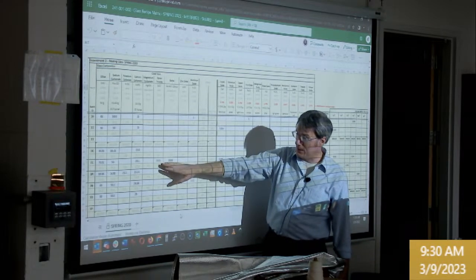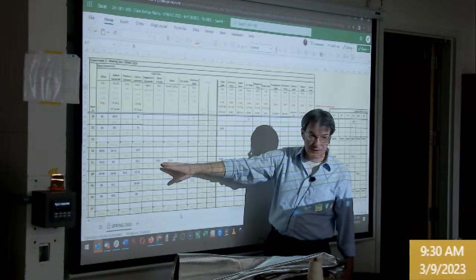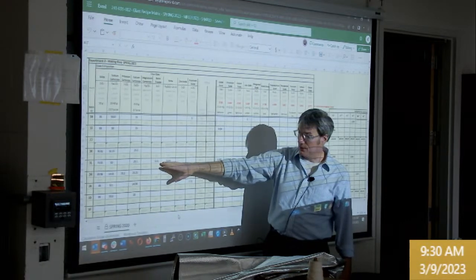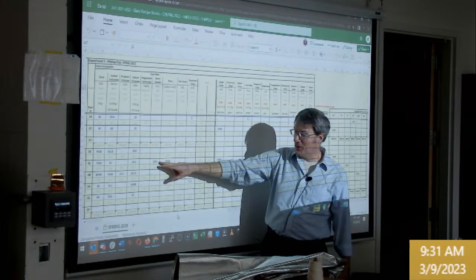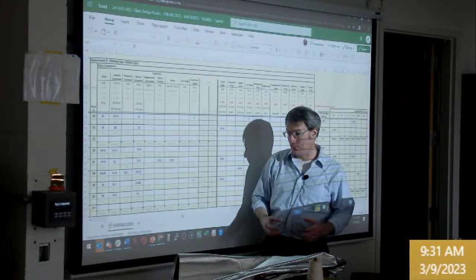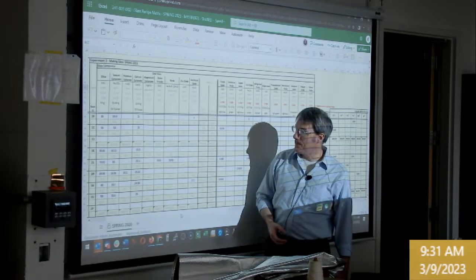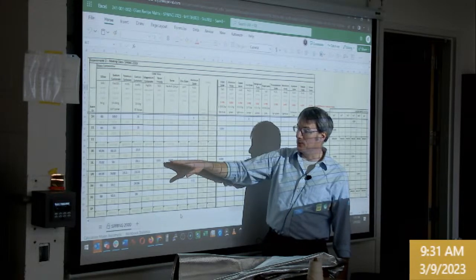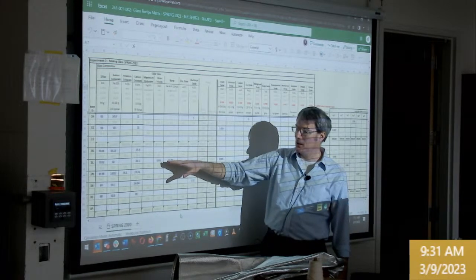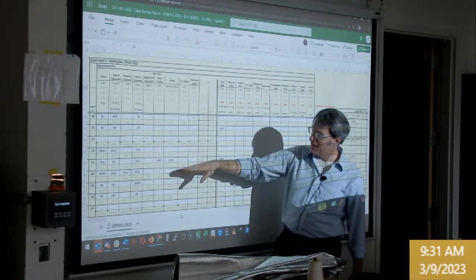This one is going to be crazy low viscosity. We'll have to carefully place this one on the metal, because I'm predicting it will be very, very low. That'd be kind of cool. We've never had this much boron in the glass before, so I really don't know what's going to happen. It'll probably smoke a little bit too. Don't breathe that.